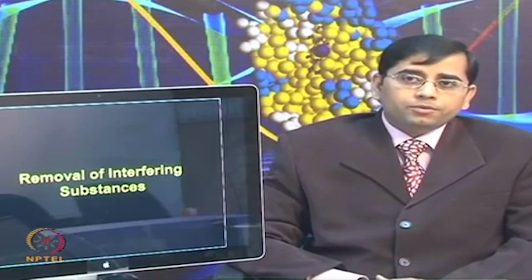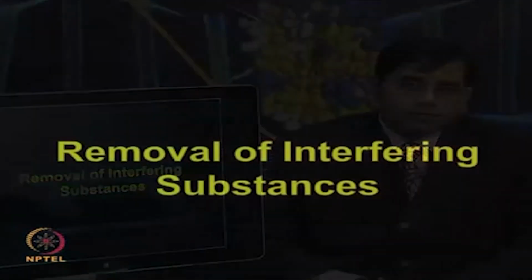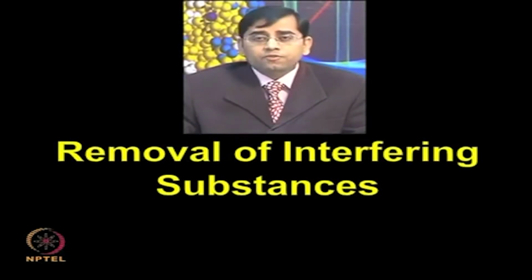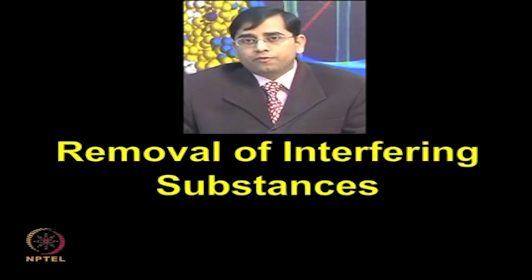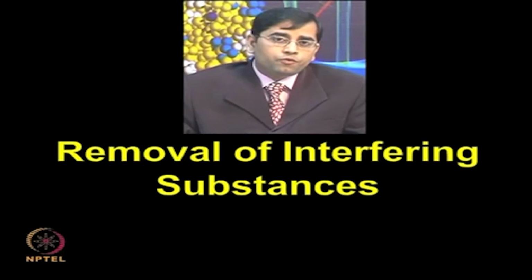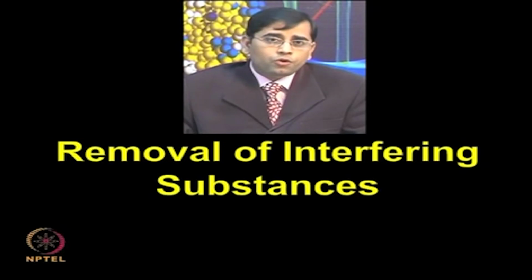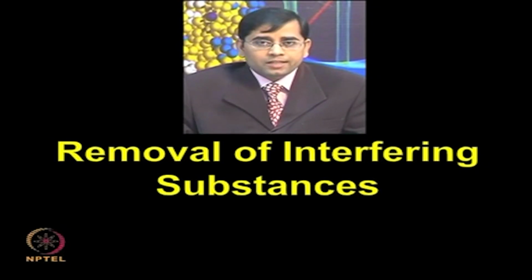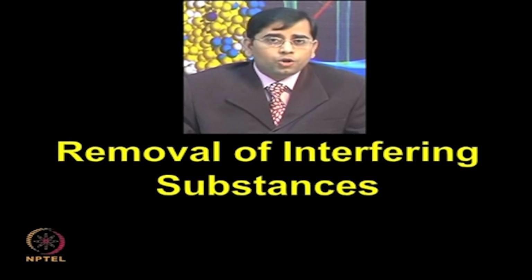Now, let us talk about how to remove the interfering substances, because as I mentioned, the interfering substances are very detrimental for any proteomic application, whether you want to perform 2-dimensional gel electrophoresis, or go for directly LC-MS based applications, or surface plasmon resonance label-free proteomic techniques, or apply on protein microarrays.